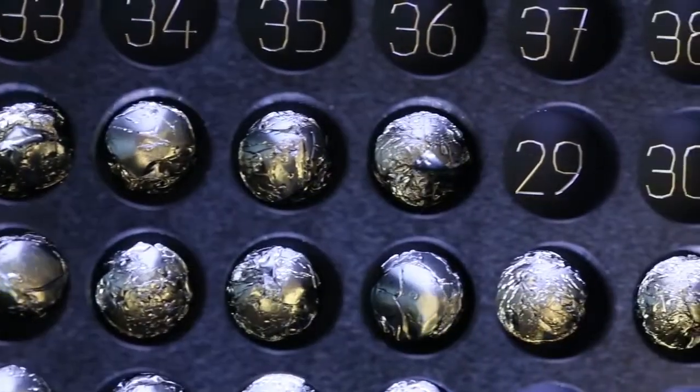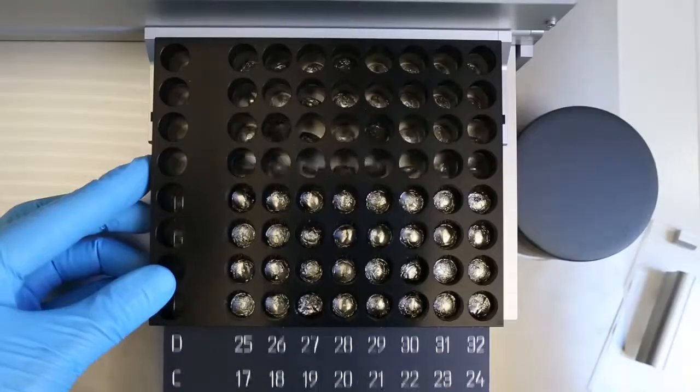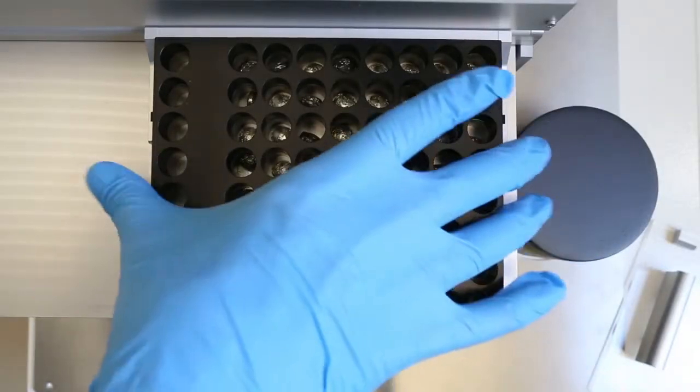This begins when filling the fully automated sample loader. Simply pull out the spacer and the samples automatically land in the correct position.